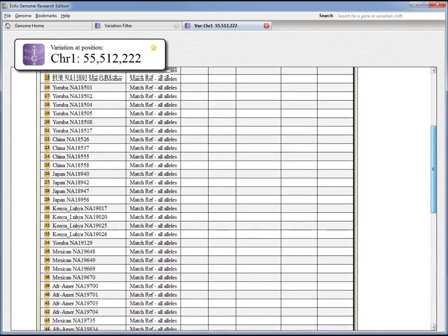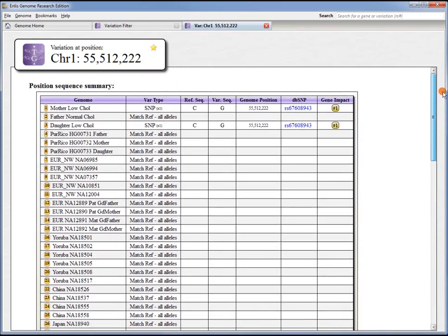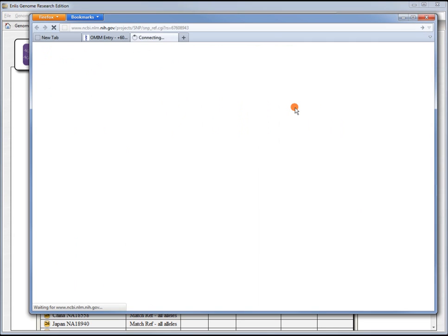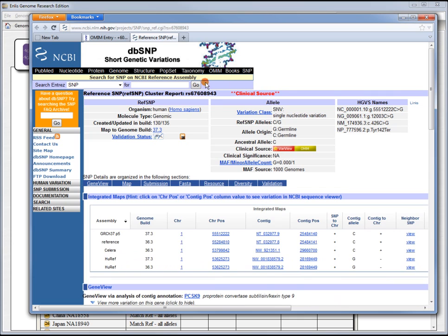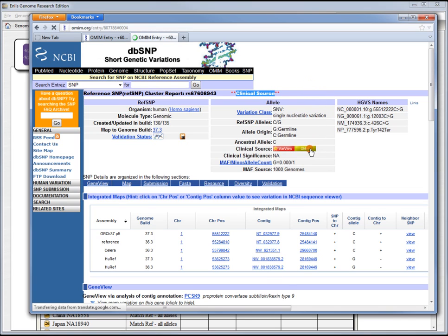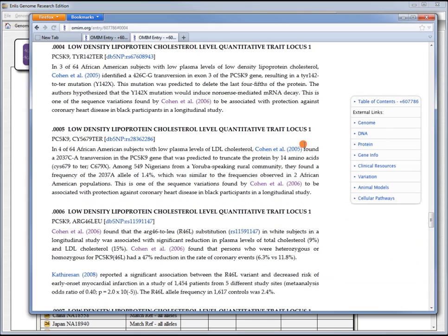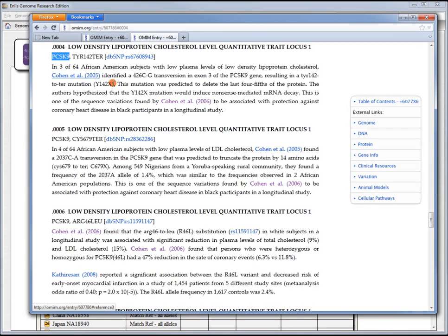If this variation was found in dbSNP, it will be listed here, and you can click on the dbSNP link to open up the site in your external web browser. At this position, we can see that indeed this variation has already been identified as clinically associated, and we can click on the OMIM link here to go directly to that position. Here we are at PCSK9, tyrosine amino acid position 142 to a stop codon, and we read about 3 out of 64 subjects with low plasma levels of LDL cholesterol this mutation was already identified.